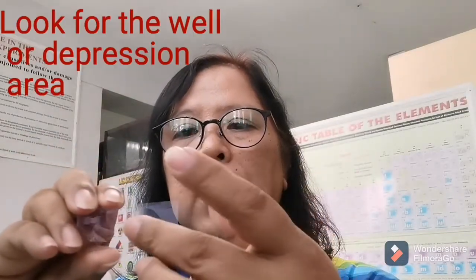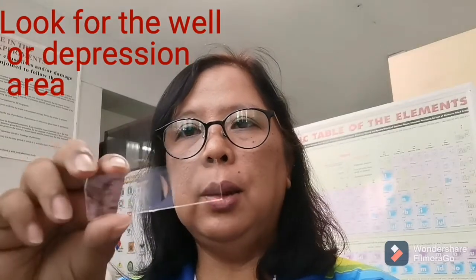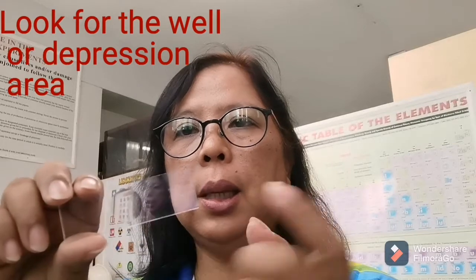Okay, the first thing that I will do is to apply petroleum jelly on this area of the depression slide. See to it that you feel where the depression area is. In this case, what is in front of you is the depression area. This portion is smooth and flat. So this is the portion of the glass slide that we will be using.